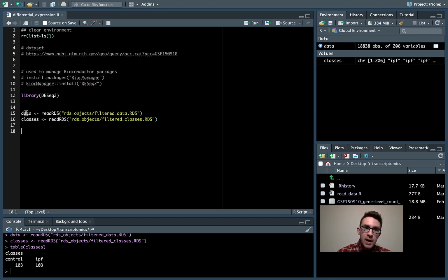And then if you guys remember, this data matrix we have here, although it's not literally a matrix, it's actually a data frame, but you guys know what I mean, matrix. Not literally the R object called a matrix, but basically a data frame in matrix shape kind of.